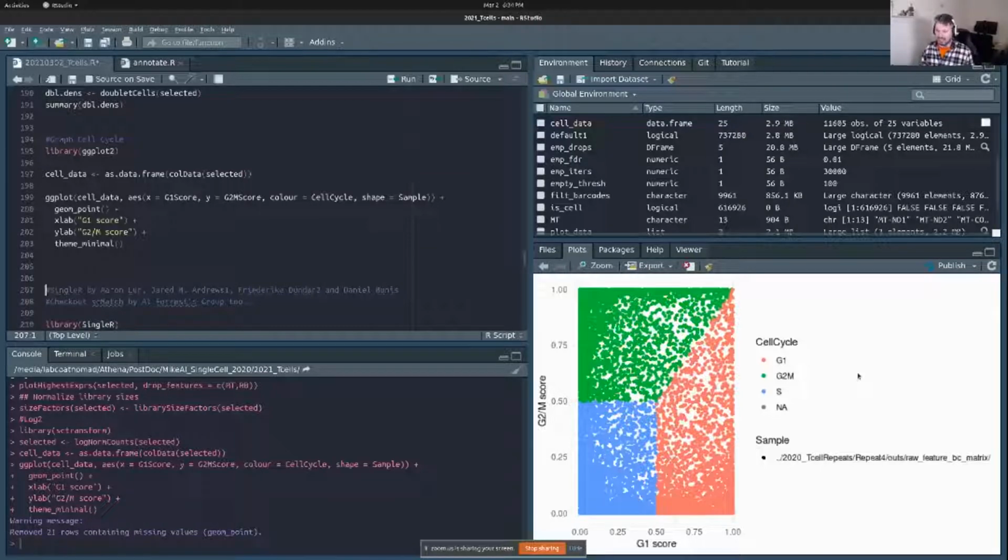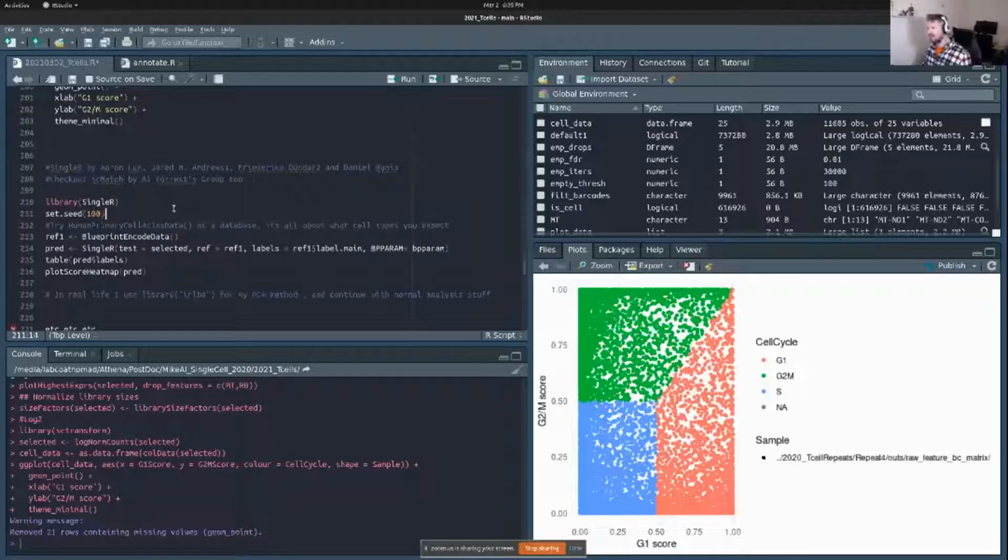And when you're looking at really tight subpopulations, which a lot of us are, because all the big macro stuff's been done, differences in some of these genes are actually important for cell types. So there's like 20 types of CD8 T cells, right? Activated T cells, naive T cells, exhausted T cells, cytotoxic, memory. Some of the differences are in some of these cell cycle genes. And if I regress them out, I may not have the resolution I need to identify those subtypes. So I keep them in. Most people are keeping them in these days. It's only those older papers that are regressing them out, or if you have an experimental reason to regress them out.